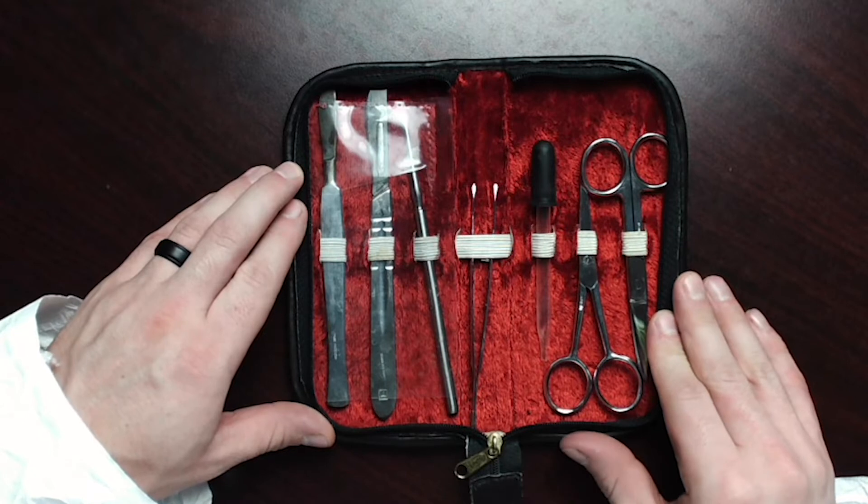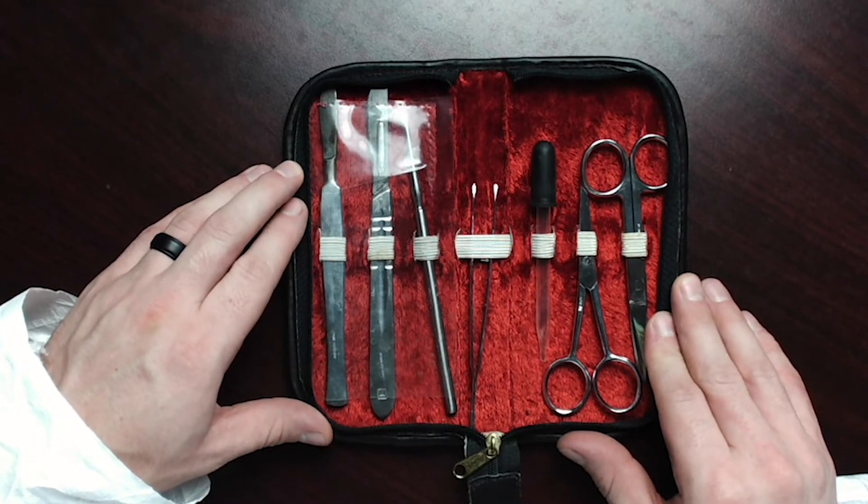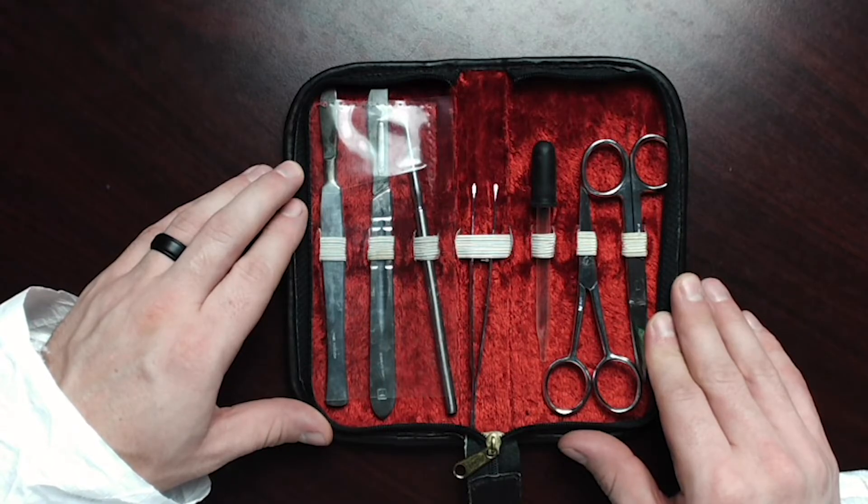In a typical dissection kit, you may find a fixed blade scalpel, a removable blade scalpel, a dissection probe, a pair of forceps, an eye dropper, and different types of scissors. Additionally, your instructor may have other tools that will be specific for your dissection.